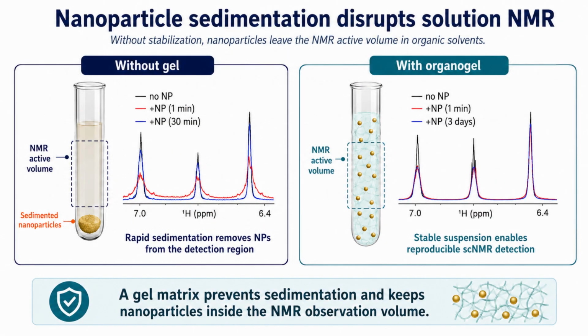Nanoparticle sedimentation is a major obstacle for solution NMR studies of adsorption. During the long experiments needed to detect weak ligand nanoparticle interactions, particles settle out of the NMR active volume, and the sample is no longer homogeneous. As a result, the spectra become difficult to interpret, and quantitative surface contrast NMR measurements are compromised.